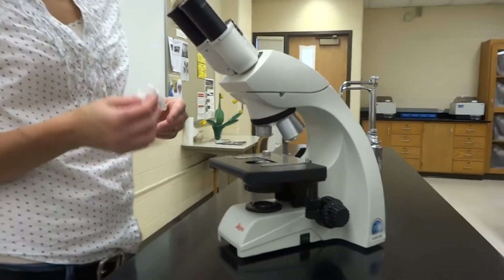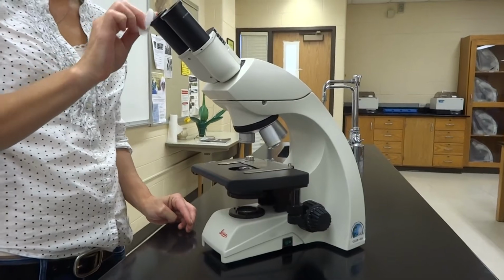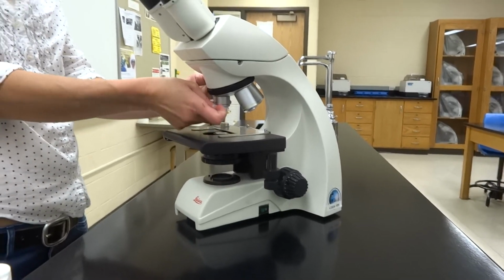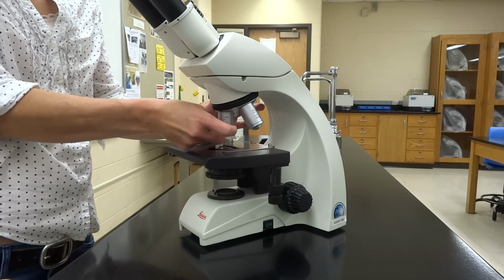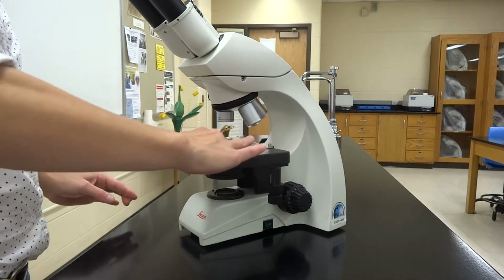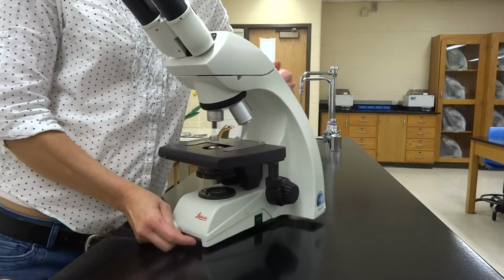Starting with the oculars, because your eyes were touching that. The condenser lens. Just gonna clean the whole thing for real for you guys. And then the objective lens, if you can hit them. Yeah, I know, the 4X is really hard to get, but the 10 and the 40, because they stick out, you should wipe them down for us. And if there's any other spills you had, especially if you had a wet mount, it'll be nice of you to clean those up, because these are what you'll be using and everyone else will be using for the whole semester. And then you will carry it nicely back to its numbered shelf, or again, I'll take points off if you don't.